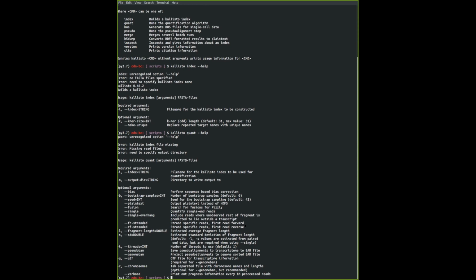But if you do have some problems, where you see your transcripts are not getting enough reads, or you're getting a whole lot of 0 reads from all your transcripts, that means this option needs to be supplied, and you should check that your reads are of the right orientation. Again, if you're not sure about this, you can let me know if you're having problems in the future deciding the strandedness of your data. But for the data that we have, it's RF stranded, and I've checked.